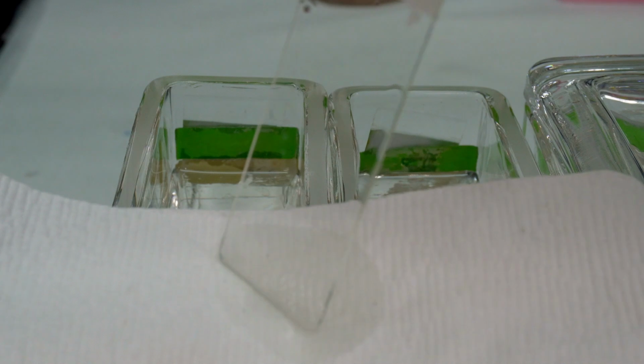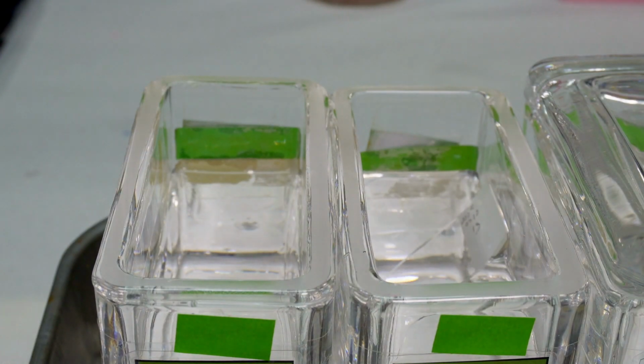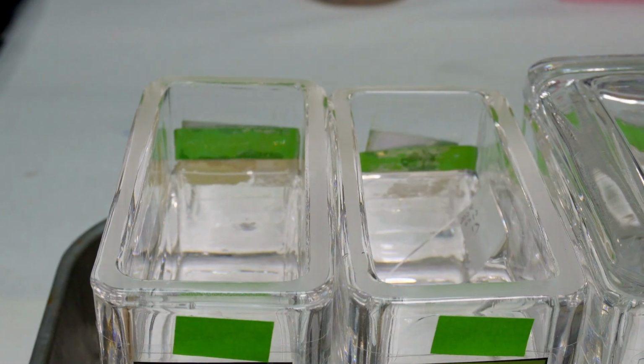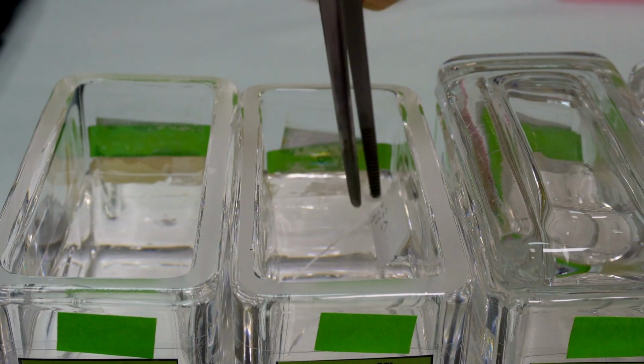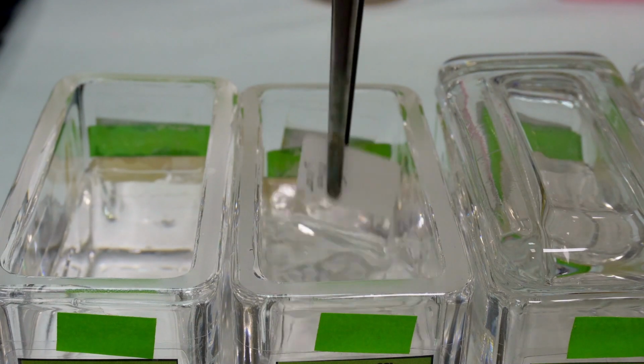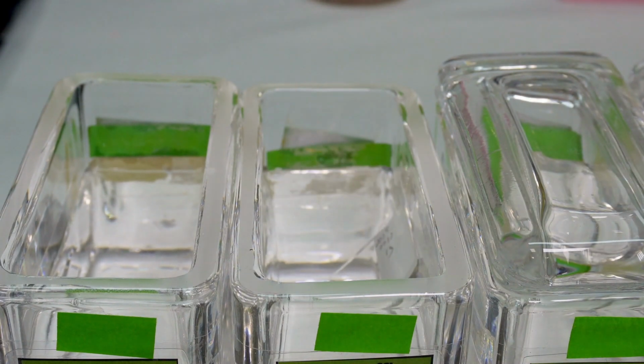Okay, we've journeyed from egg to these slides with incredibly thin sections stuck on them. But there's still mostly transparent wax and tissue, right? You can't see much detail yet. Not really, no. To actually visualize the cells, the tissues, the different structures, you need to stain them, add color. But first, you have to get rid of all that paraffin wax again. Right. How do you do that without damaging the tissue slice?